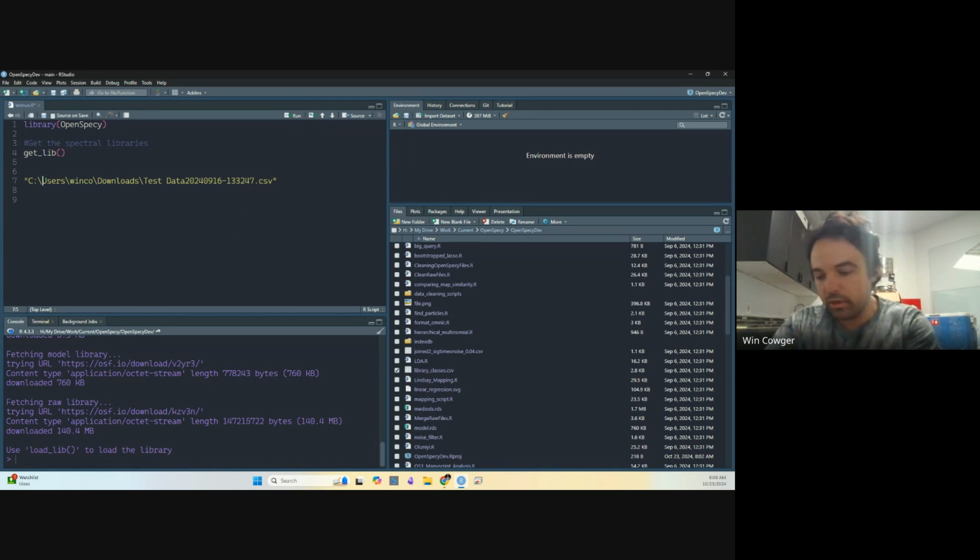On Windows, this is an issue with the slashes, so you have to actually double them. Is this backslash or forward slash? Honestly, I can't remember. This slash, you have to double for this kind of slash. The other way, you don't have to double them. So if it was this kind of slash, you don't have to double it.